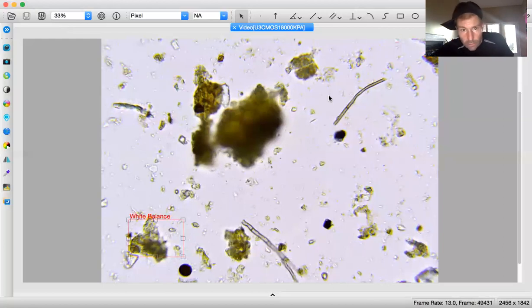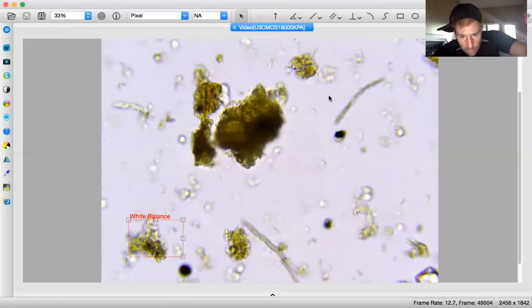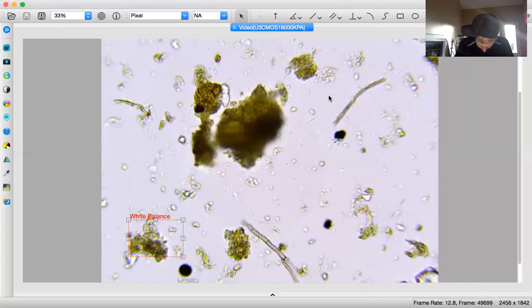This one down here, it's got some girth to it, man. That's some diameter on that one. And it goes all the way down to there. I'm seeing about 2.5, 3 with that extra branch right there. That's about a 3.5 for the fungi. Well, that was a 0.35 actually, not 3.5. So that's a 0.2 on this one, 0.35.